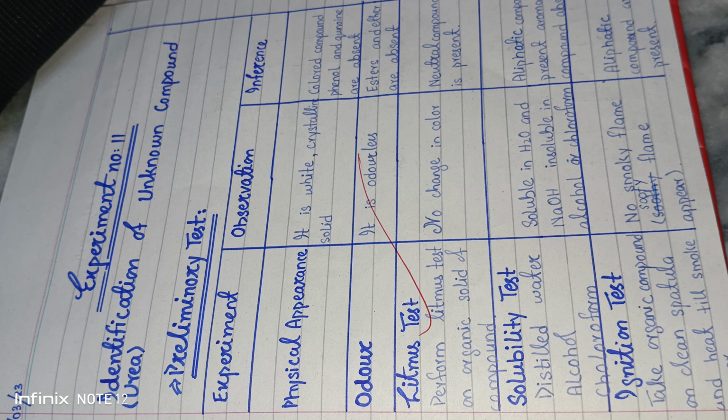Assalamualaikum everyone. In today's video, we are going to discuss another important organic chemistry practical, and this video is about identification of the unknown compound urea.